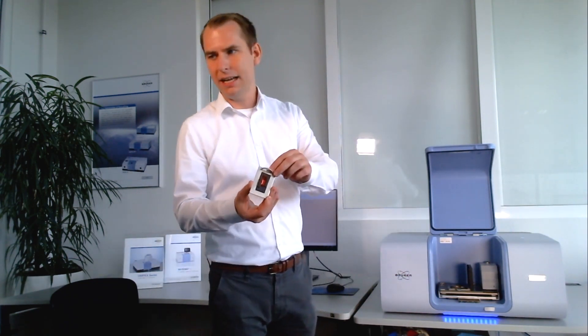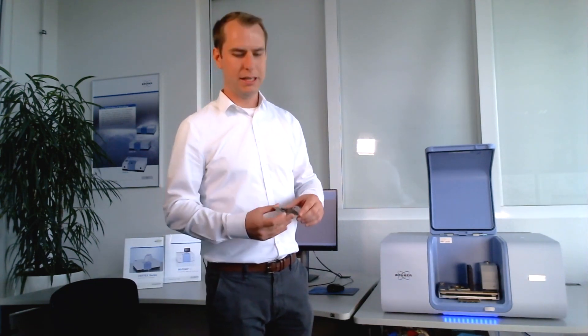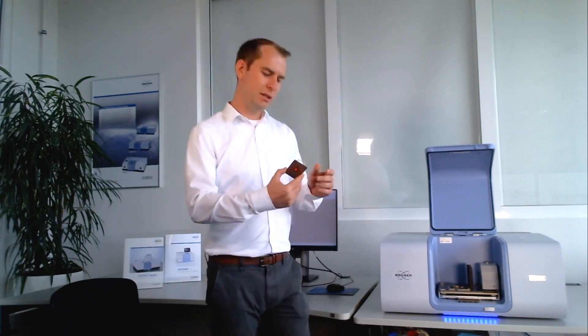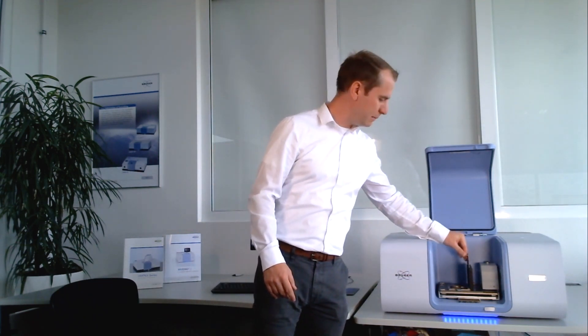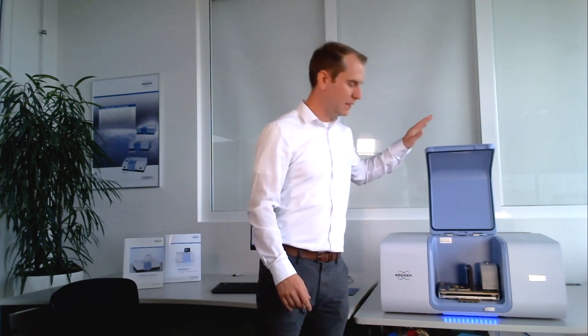I've prepared a slice of this red packaging foil and put it on a sample holder. Now I will insert this sample holder inside the two-position sample shutter. I will close the sample lid and then we wait a couple of seconds to stabilize the environment in the spectrometer. After this I will show you the measurement in Opus.